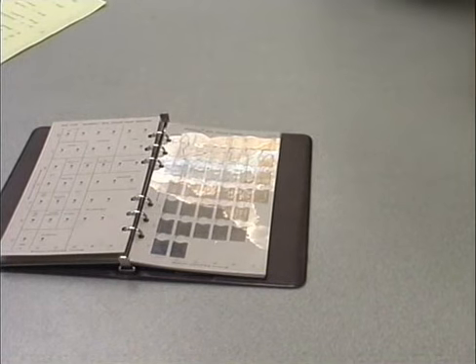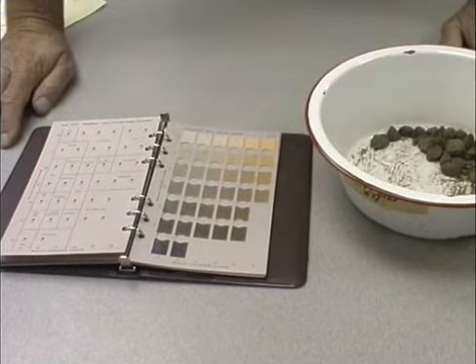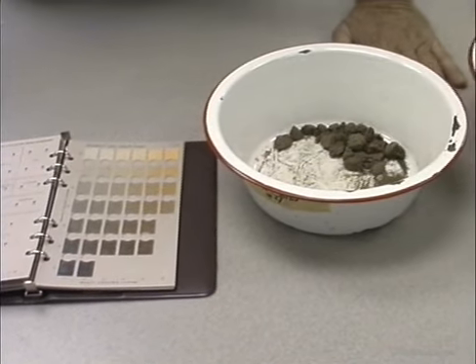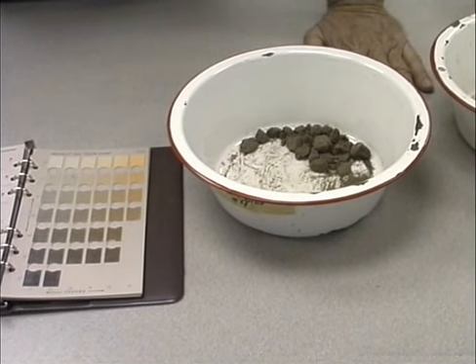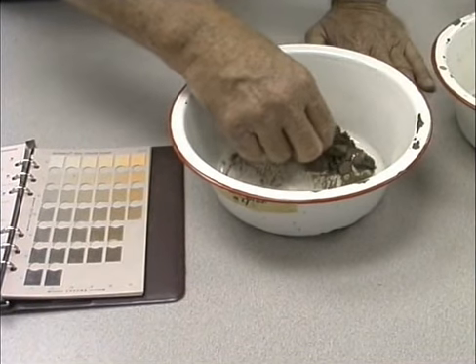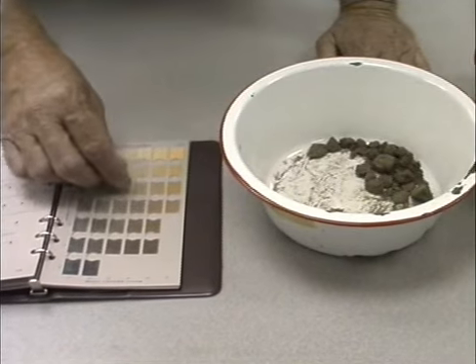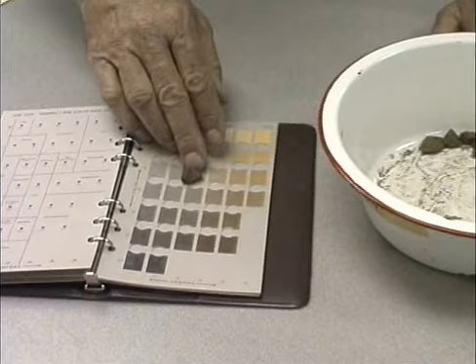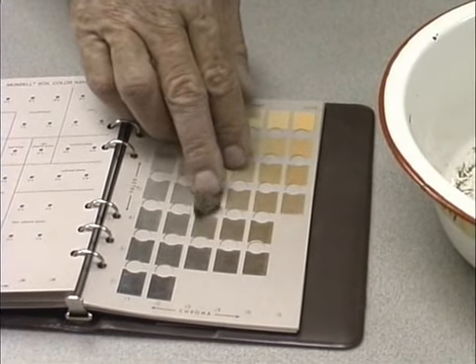The last sample that we'll examine in this laboratory today is also a soil that is much darker than the previous two. It looks similar to soil number 1. This particular sample, we remove a ped from the pan and place it onto the page. We can see that we're going to move down the page quite a ways. It's a fairly dark soil. Move down into this range.